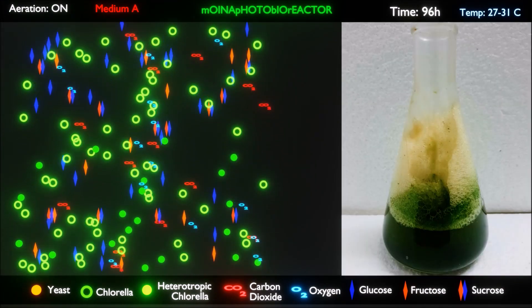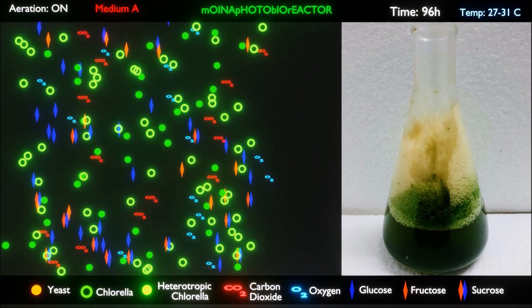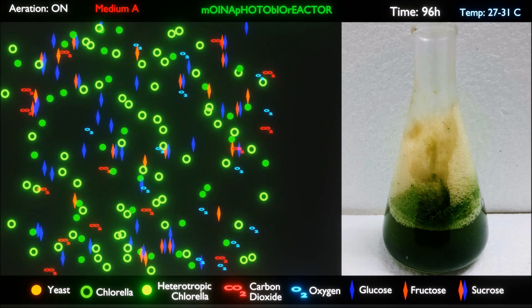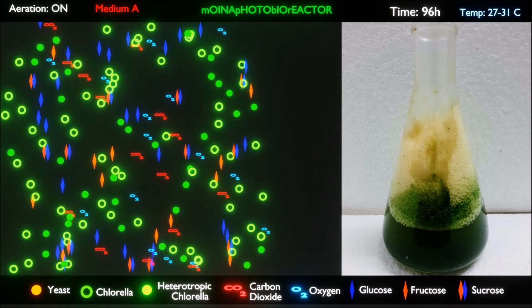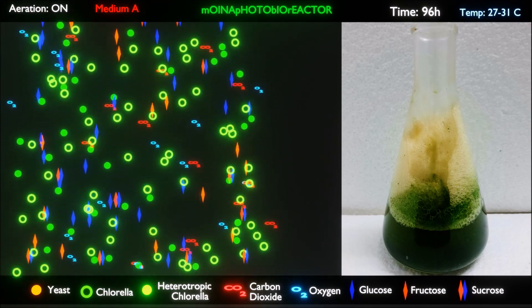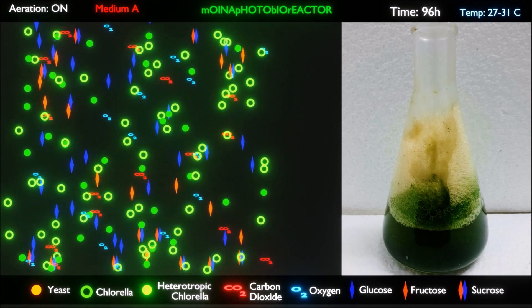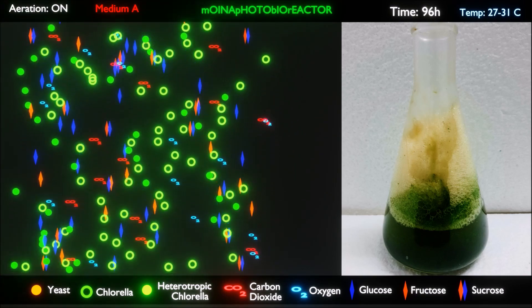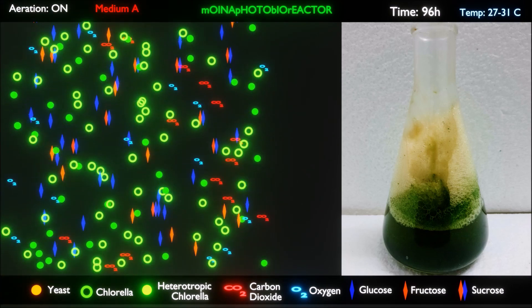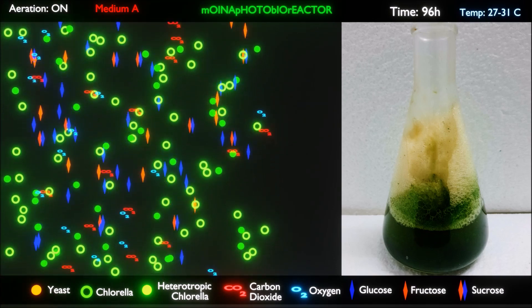After this 48 hours, 2 milliliters of molasses is added every 12 hours for the next 48 hours. After this second 48-hour period, an emulsion will form at the top of the conical flask, and this emulsion is mainly fatty acids from dead Chlorella algae. The culture is now rich in fatty acids from Chlorella in heterotrophic condition.